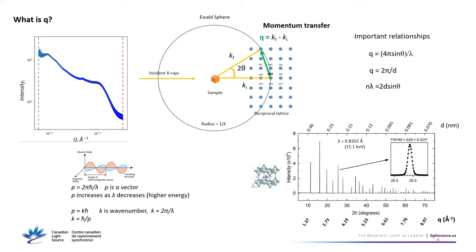And you can express that in terms of this wave number k. And in this Ewald sphere depiction of diffraction, momentum transfer is the difference in momentum between the incident photon and the one that scatters out there. Somehow that photon that came out got some momentum, and it came from the scatterer there. So somehow momentum was transferred to it.